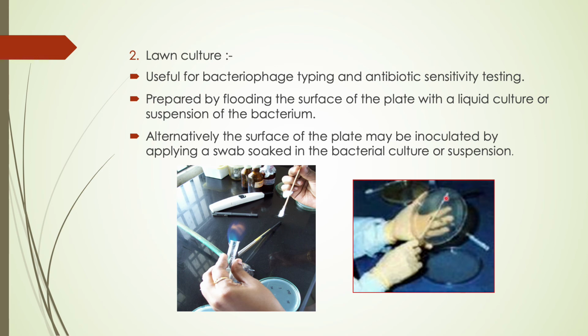We will learn how to study the activity of the antibiotic and the zone, what the zone is and how we can measure it. But if you want to study antibiotic sensitivity or antibiotic activity, we need the lawn culture method.